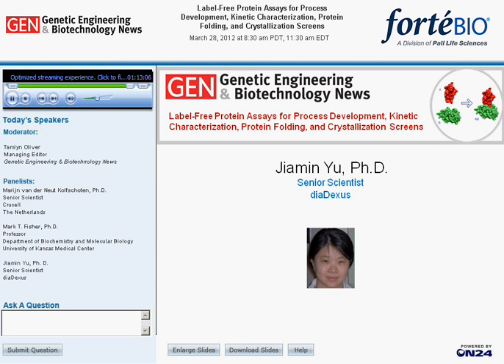Versus that, you know the answer in a couple hours, whereas with the traditional method you have 3 or 4 people running expression gels or analytical studies, going through high throughput purification and running everything on gels and sizing columns. So calculate the cost for that, and I think the binding rate screen is, to me, a lot more economical. And the sensors, I have not tried to reuse them because the cost wasn't that bad. To us, it was already saving a lot of money.